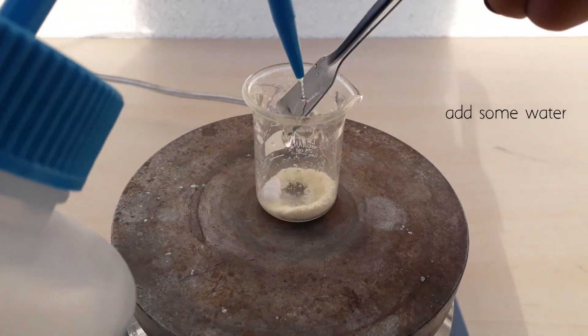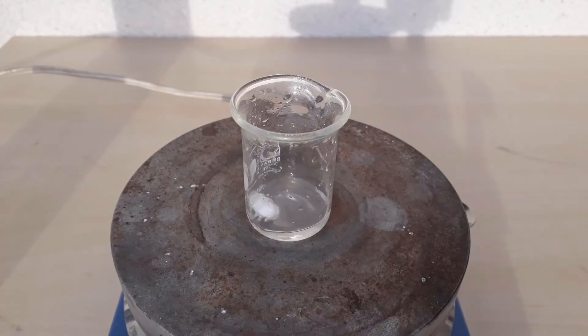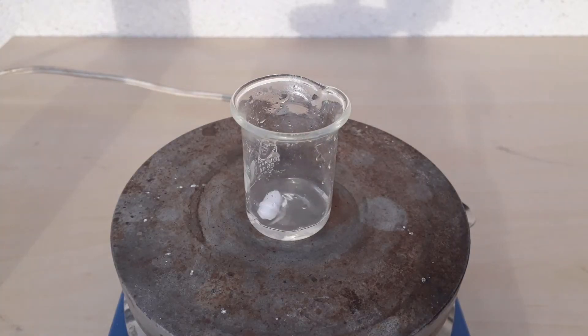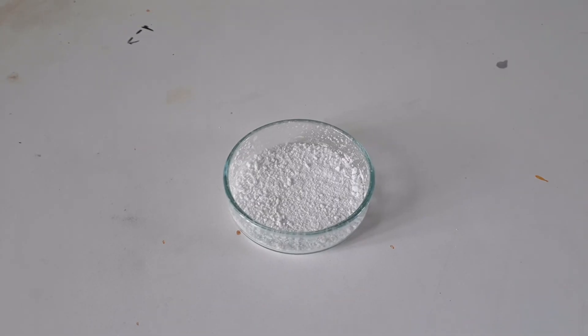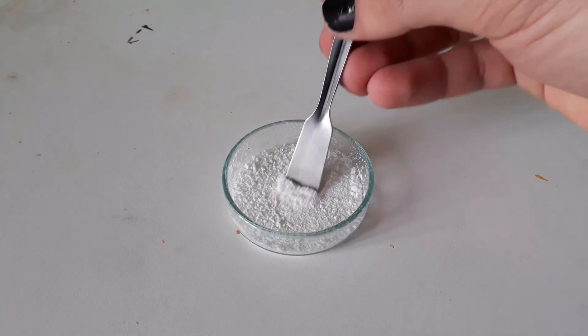To clean up the material I add a small amount of water and bring the solution to a boil. I filter it into a Petri dish and boil it to dryness.